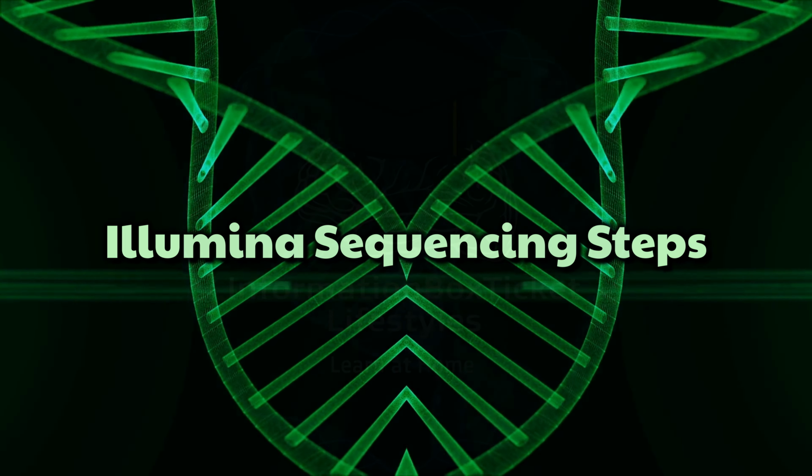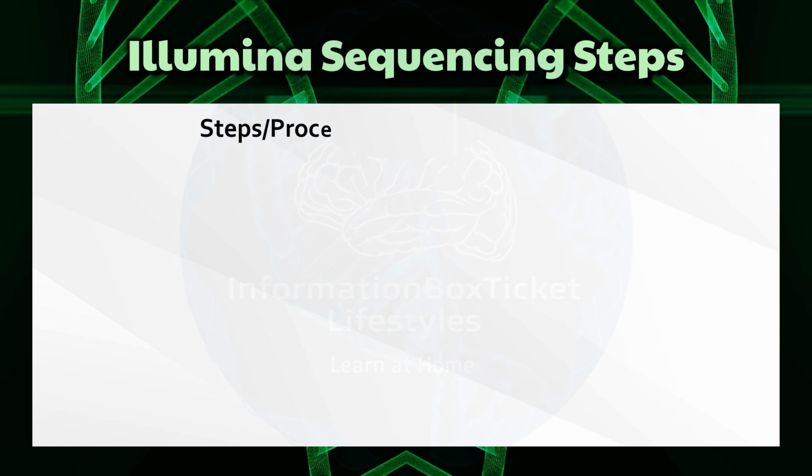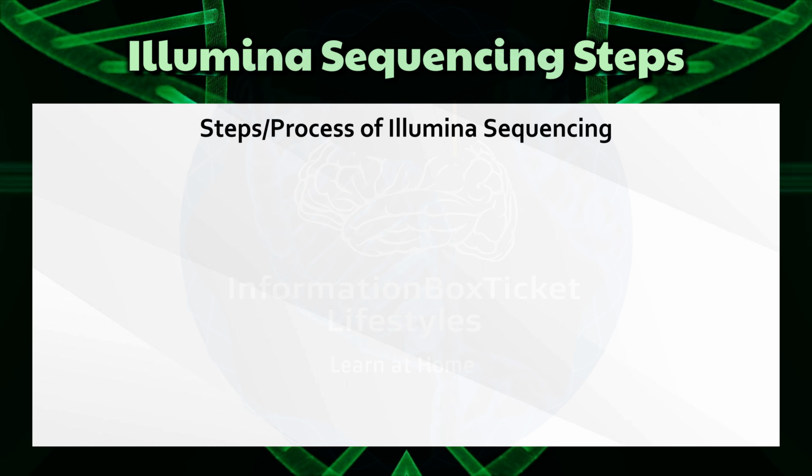Illumina sequencing steps. Steps. Process of Illumina sequencing.